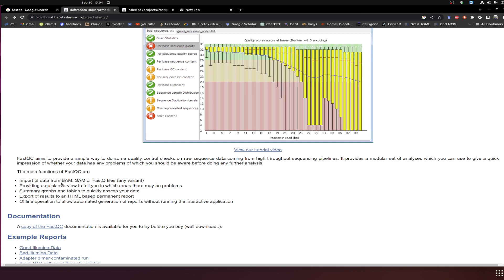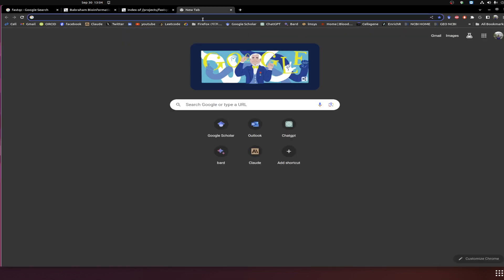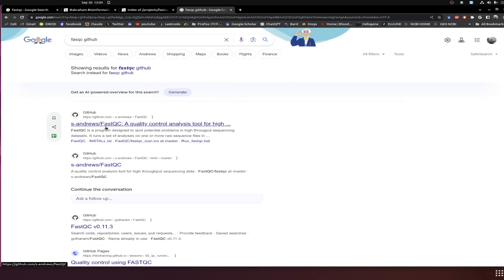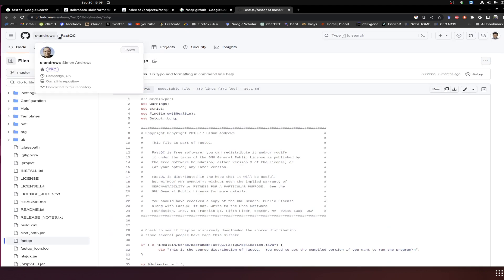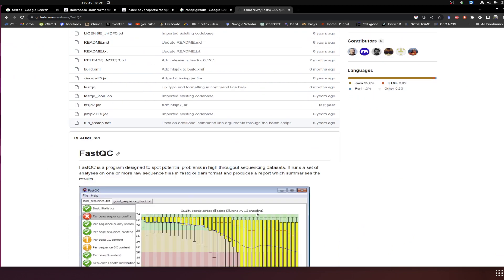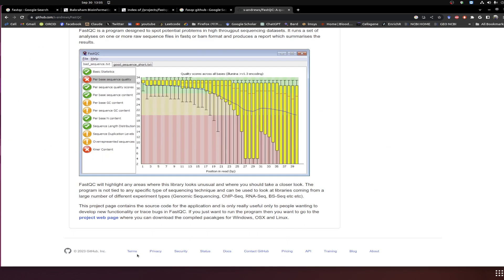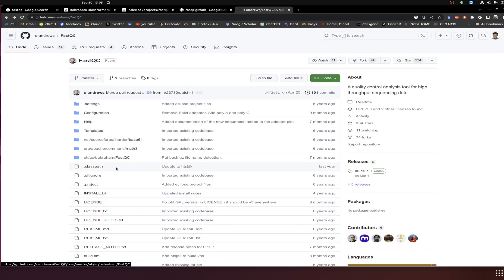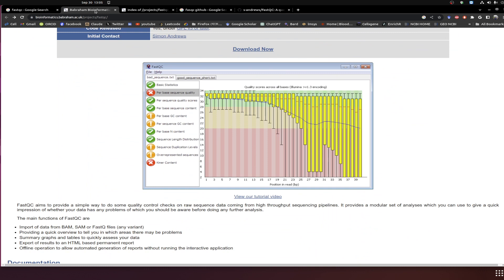FastQC can be used with BAM files, SAM files, and FASTQ files. If you have sequencing FASTQ files and generate BAM or SAM files from them, you can import those and check their quality. If you want to go through the code, you can search for FastQC on GitHub. The GitHub page refers back to the same documentation site, but if you have detailed knowledge of the dependencies and other components, you can explore it there.